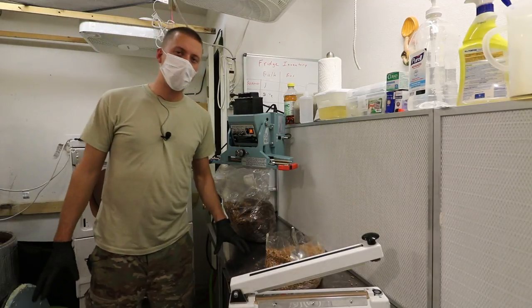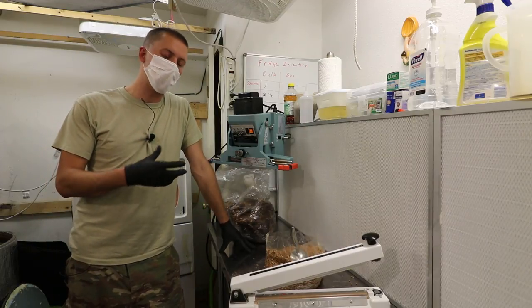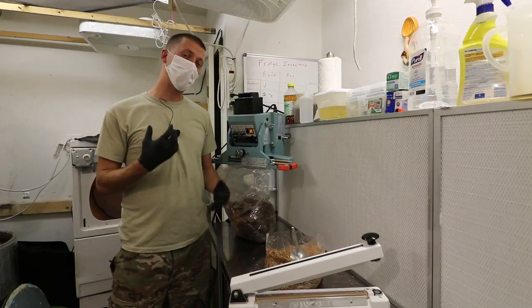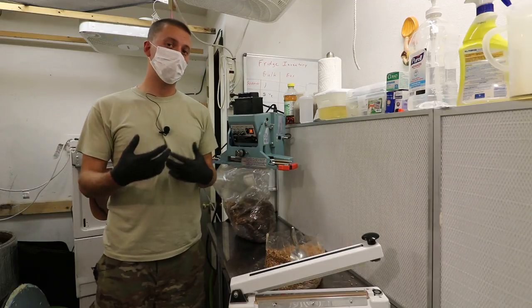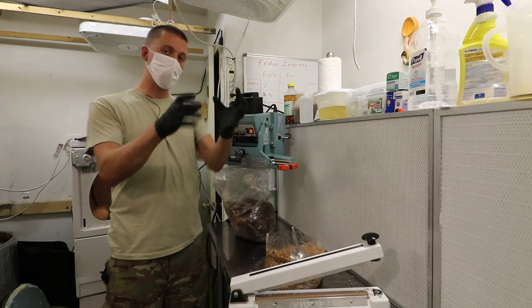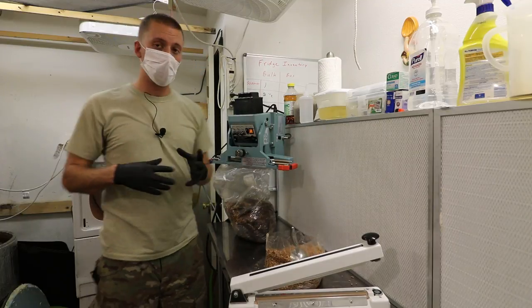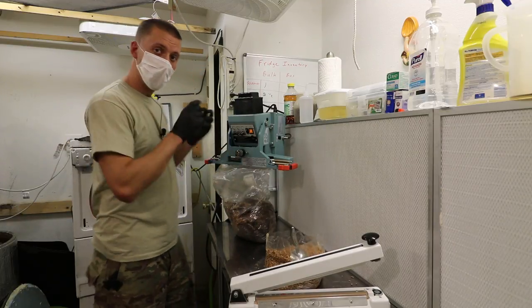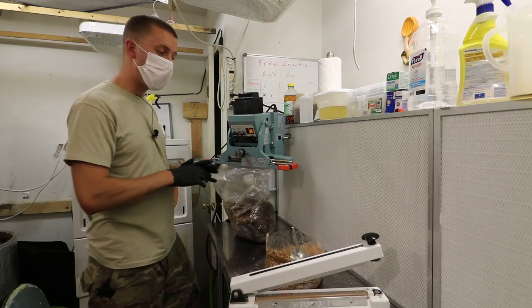Welcome — this video is about efficiencies in your lab. Whenever you're doing mushroom farming, you want to make sure you're handling the bags as little as possible. Every time you're handling a bag, it's more time. You don't want to be moving a bag here, then there, then there. If you're going to do something, grab it off your rack, inoculate it, seal it, put it away.